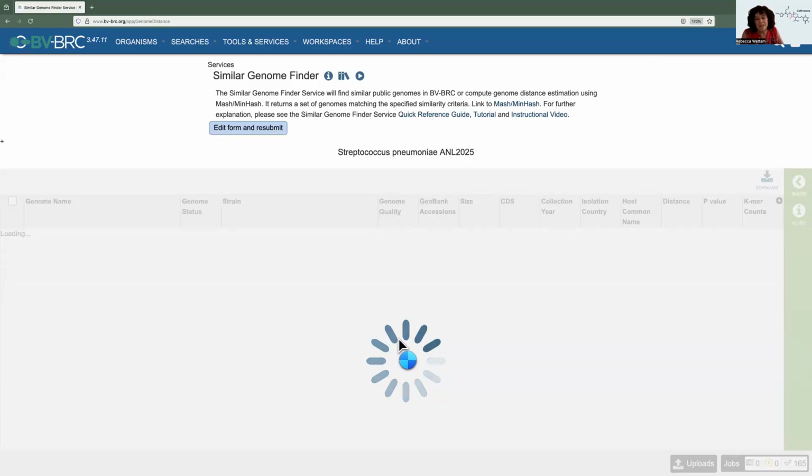And so we'll just sit and wait. And if you watch that little wheel spin, it's mesmerizing. Remember, it's searching across 1.1 million genomes. So more than that, I think it's 1.16. And it's climbing all the time. Because every night we go in and we get new genomes from GenBank, ones that we don't have, and we annotate them and add them to the database.